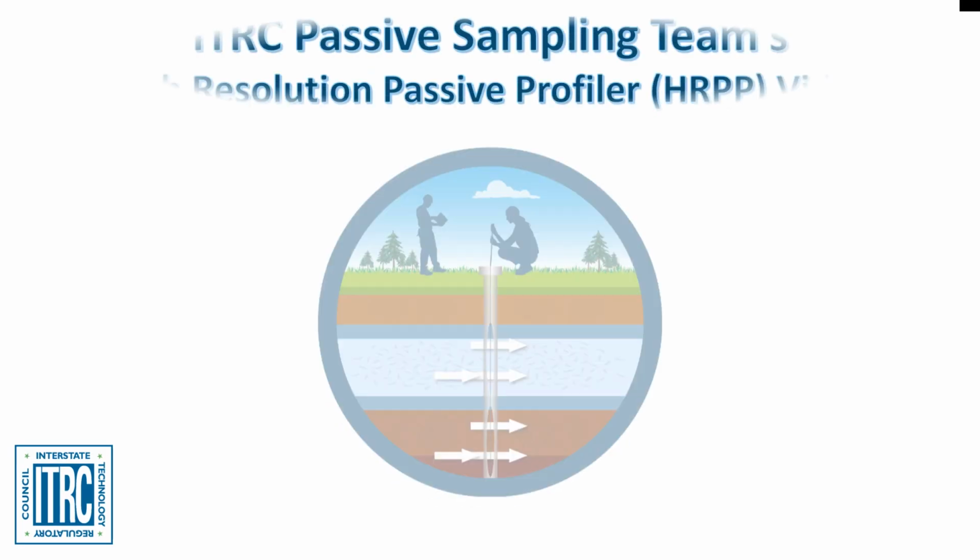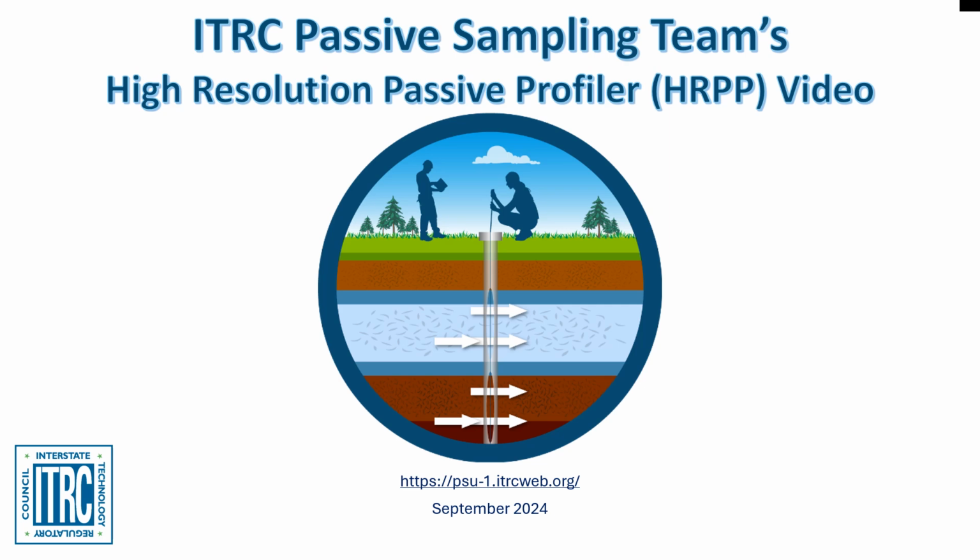Welcome. The Passive Sampling Technology Update team is proud to present an overview of the high-resolution passive profiler technology. This quick video will provide a high-level overview of the device, as well as instructions on how to use, deploy, and retrieve the device. For more information on this and other passive sampling technologies, please visit the Passive Sampling Technology Update Guidance document.